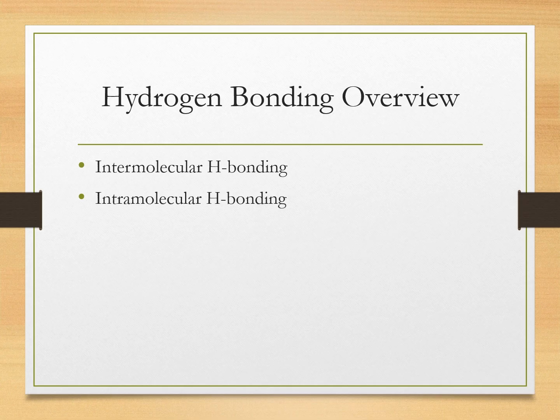However, intramolecular hydrogen bonding exists within the same molecule, often forming stable ring-like structures. Both types strongly influence IR frequencies, but in different ways.